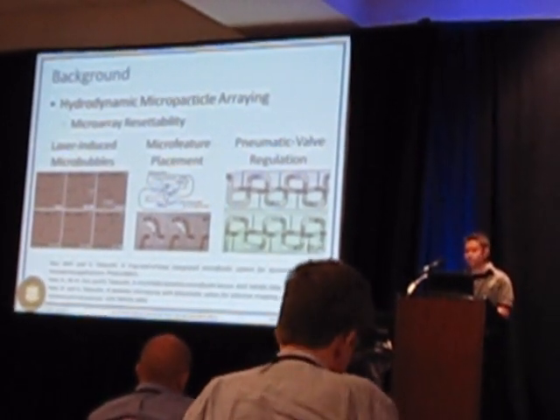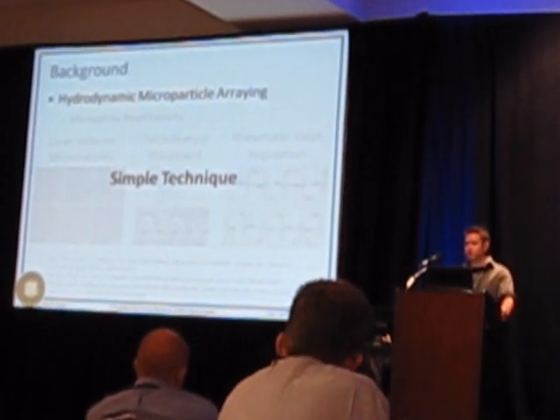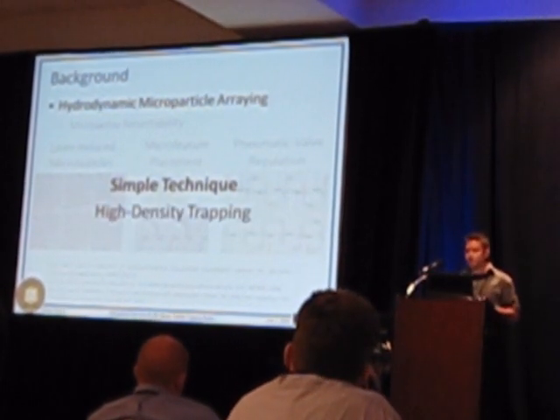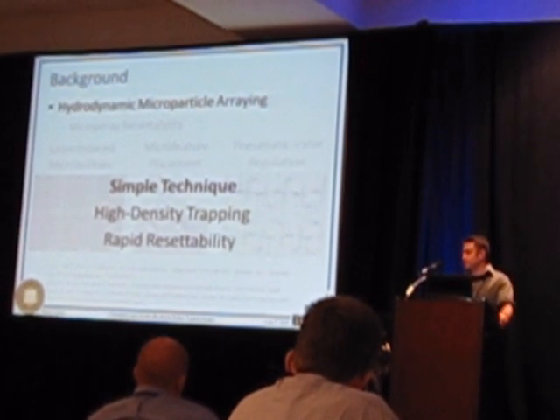But for us, what we were looking for is really the easiest, most simple technique to be able to trap and release microbeads, and specifically to achieve both high-density trapping as well as microarray resettability simultaneously.